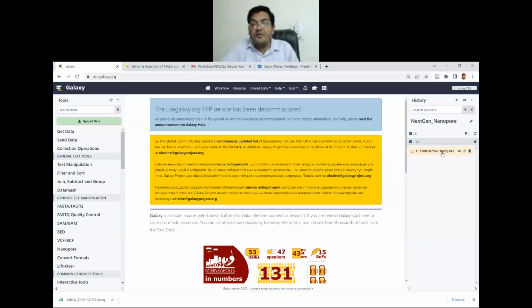So what I suggest is that in case you've not created an account, create an account on galaxy.org so that your history remains saved. If you're logging in through a guest account, once you close your Galaxy, it will not show up again. After the workshop, we close at 8. Then you can start by creating an account and doing the first step again.